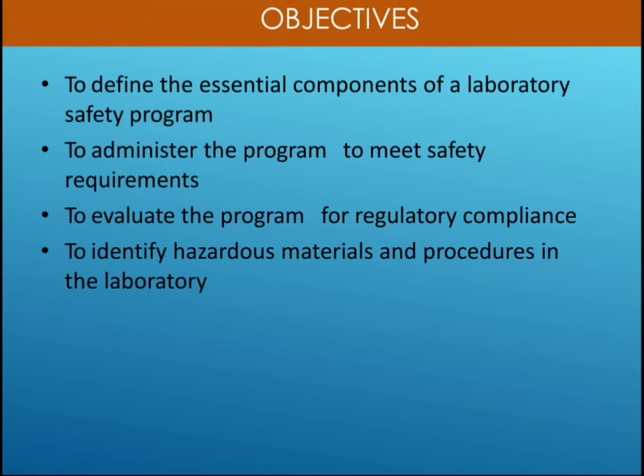Now, what are the objectives that we are going to see? Objectives of lab safety: to define the essential components of a laboratory safety program. This is one of the objectives. Then to administer the program to meet safety requirements. This is the second objective of laboratory safety. So the third objective is to evaluate the program for regulatory compliance, whether the regulatory compliance is evaluated properly or not.